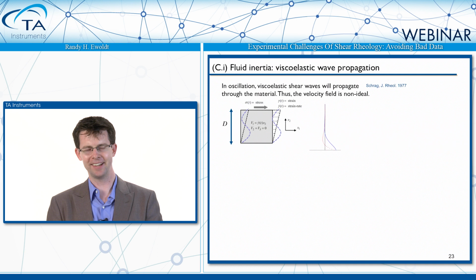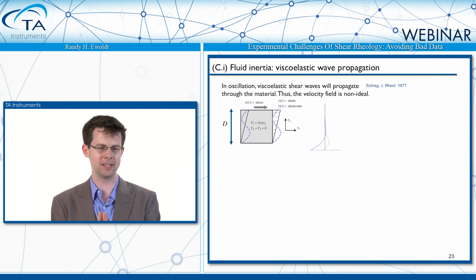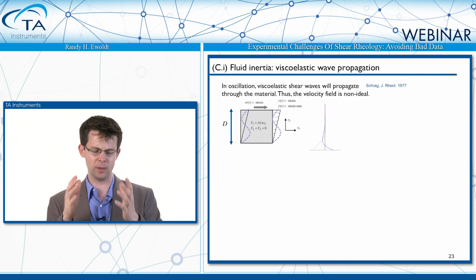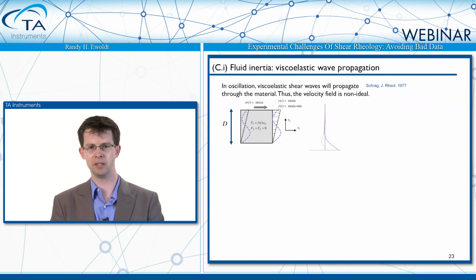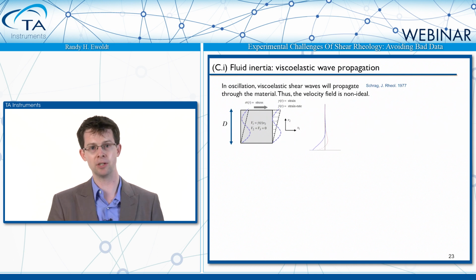Let's talk more about oscillatory accelerations. Something that's not often discussed, but I've had many people ask me about as I give talks, especially to the solid mechanics community, because they love to question the assumptions of all of our equations here, is that when we do any of these tests, not just the instrument needs to accelerate, but the material itself needs to accelerate. It has an inertia, it has its density, and if it's oscillating, going back and forth, there's acceleration that needs to happen for that material itself.